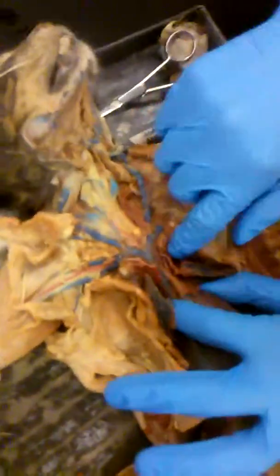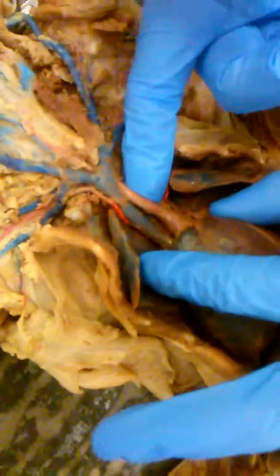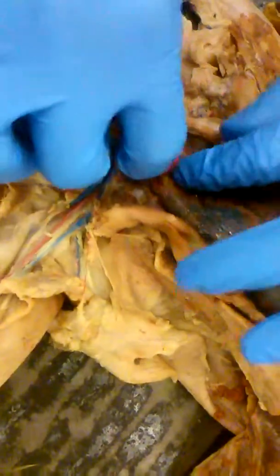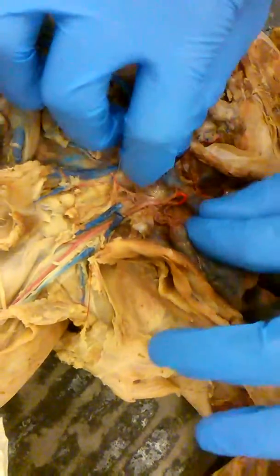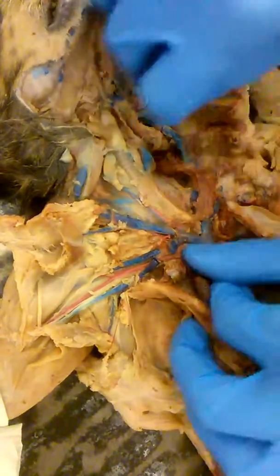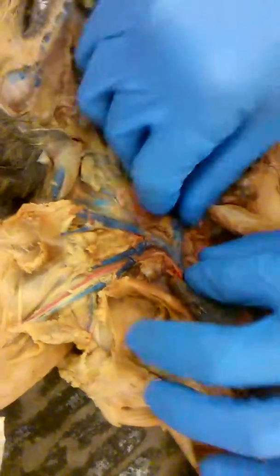So this is the heart. So this is going to be your aorta right here. And it's a little tough to see because the veins get in the way. Well, almost good. Where'd you say the aorta was again?